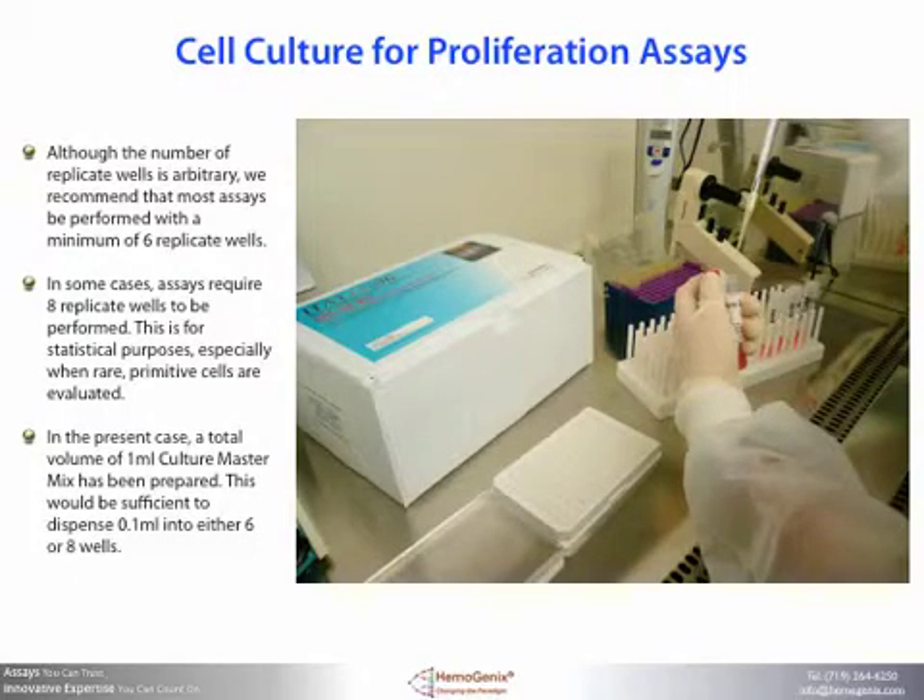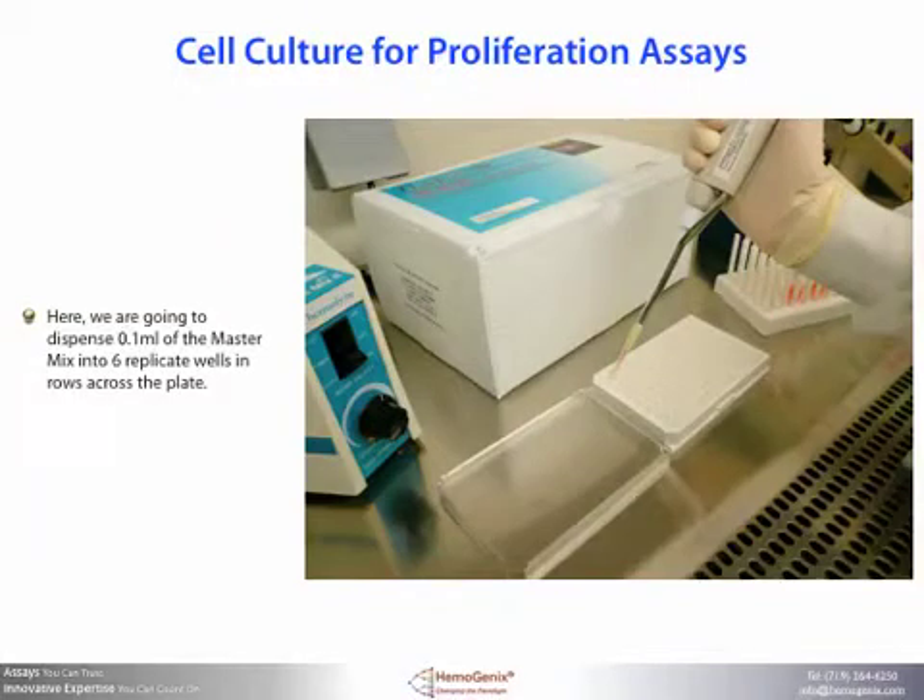Although the number of replicate wells is arbitrary, we recommend that most assays be performed with a minimum of six replicate wells. In some cases assays require eight replicate wells, particularly for statistical purposes when rare, primitive cells are evaluated. In the present case, a total volume of one milliliter of culture master mix has been prepared, which is sufficient to dispense 0.1 milliliters into either six or eight wells. Here we're going to dispense 0.1 milliliters of the culture master mix into six replicate wells in rows across the plate.